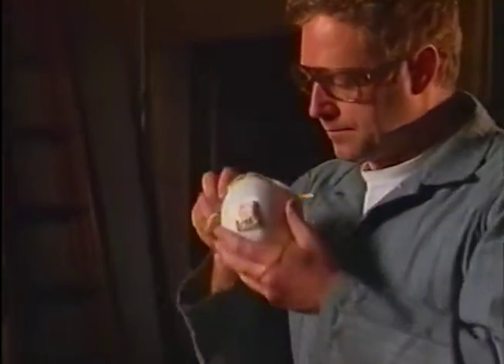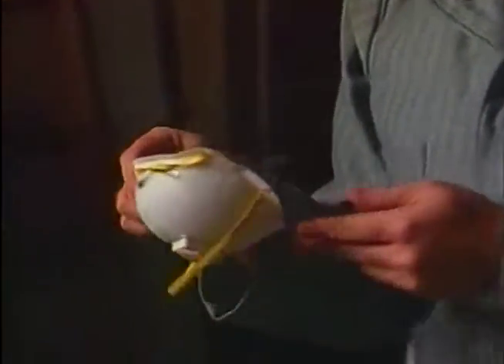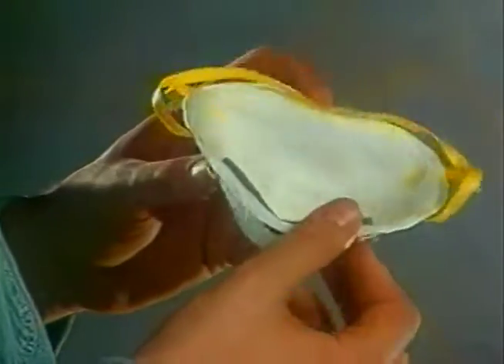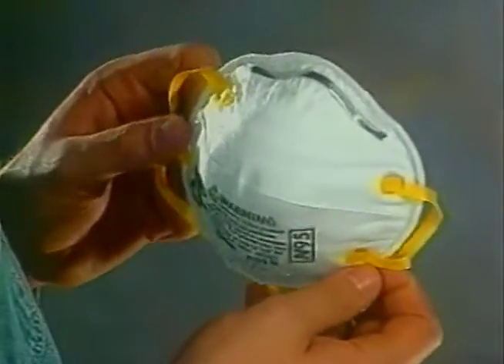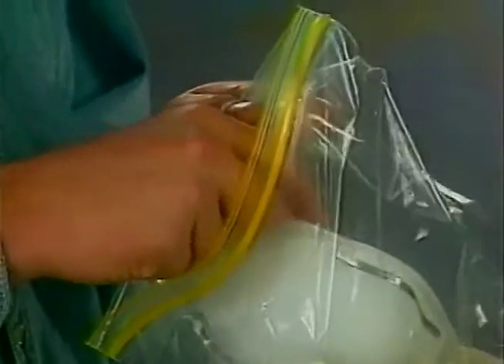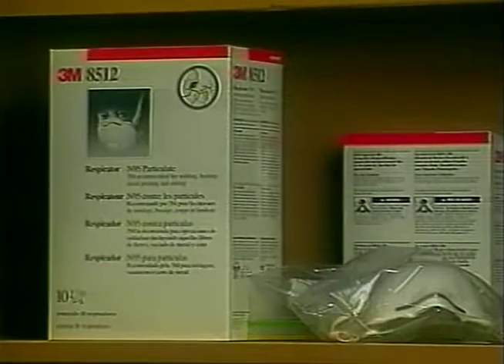A disposable respirator should be discarded if it is spoiled, shows any damage, or if breathing becomes difficult. The inside of the respirator should be clean at all times. Make sure to store a disposable respirator in a clean area if it is to be reused. A sealed plastic bag is perfect for that purpose. It is recommended to read the donning and field check instructions that are included with each box of disposable respirators.